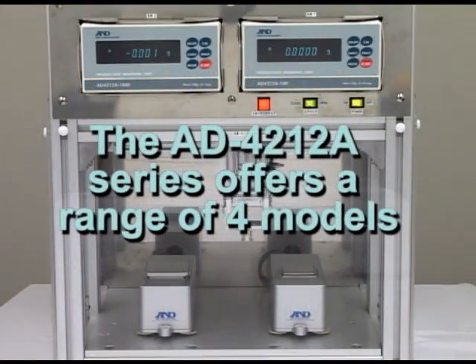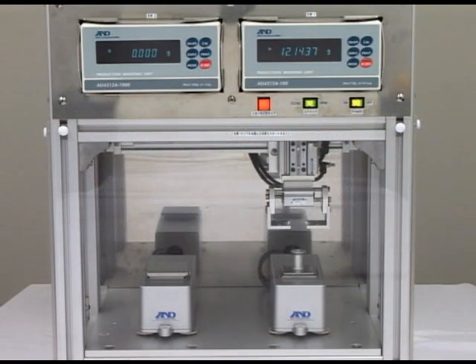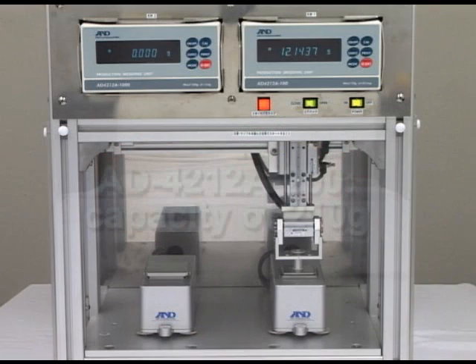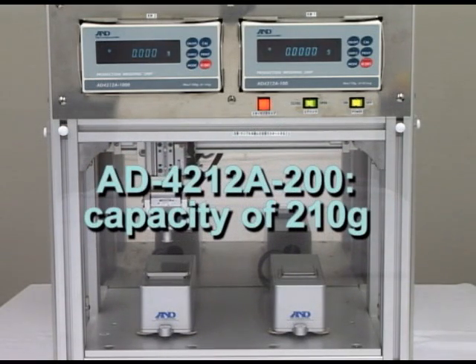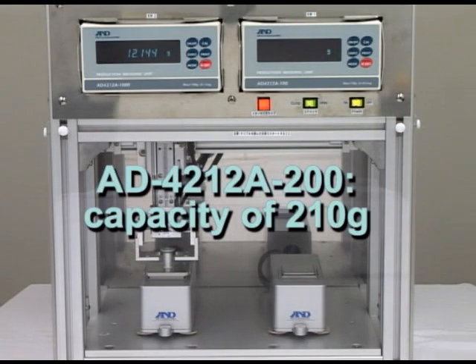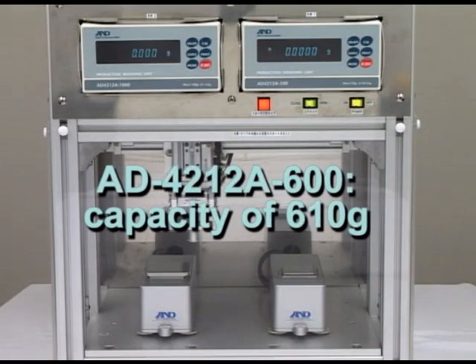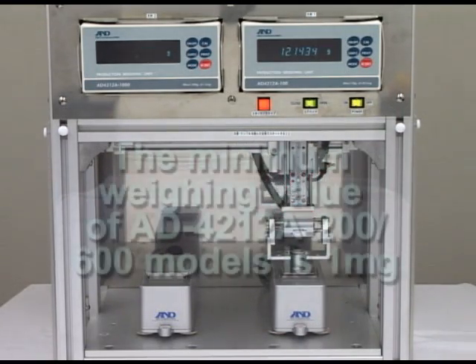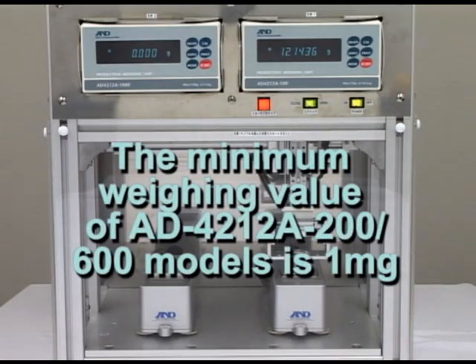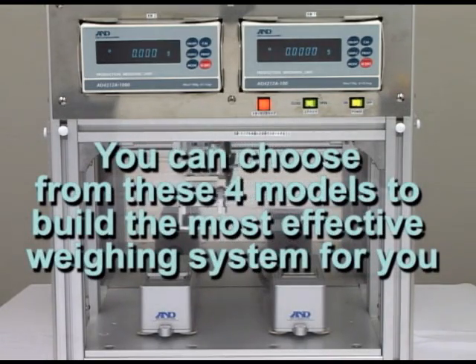The AD4212A series offers a range of 4 models. Besides the 2 models shown in this video, A&D has also developed the AD4212A200 which has a capacity of 210g, and the AD4212A600 which has a capacity of 610g. The minimum weighing value of both of these models is 1mg. You can choose from these 4 models to build the most effective weighing system for you.